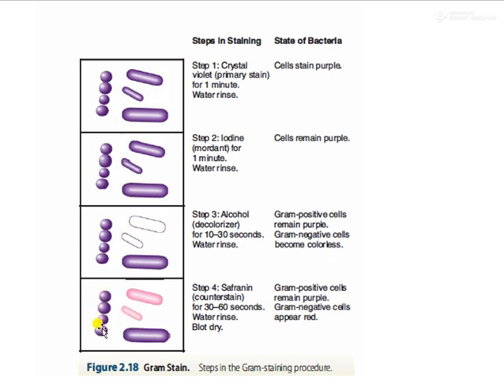All those cells which appear purple are considered to be gram positive, and all those cells which appear pink in color are considered to be gram negative in nature. Now, when you saw this picture, you might have thought these two were the same. See, they are rods. It's a thicker rod, but when the staining procedure was done, you can see that they are two different microbes because their staining is different. Okay, so let's move on.